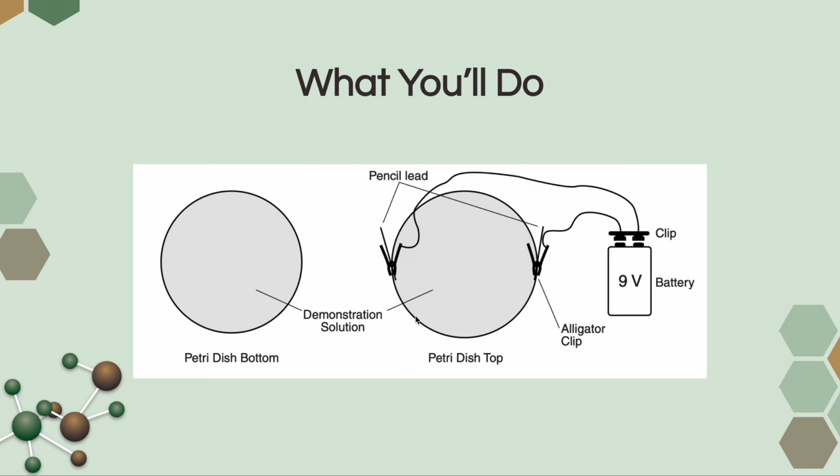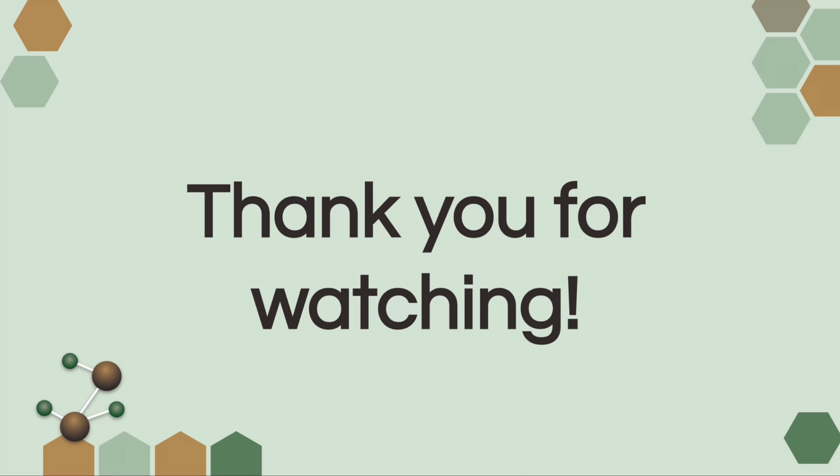Just so you know what happens in the experiment, you'll probably see some kind of color change at each end of the electrode. So that was it for the experiment. We'll post a detailed procedure for you to follow on the lab day, and your focus will be to make clear observations and then explain them with the vocab we reviewed.